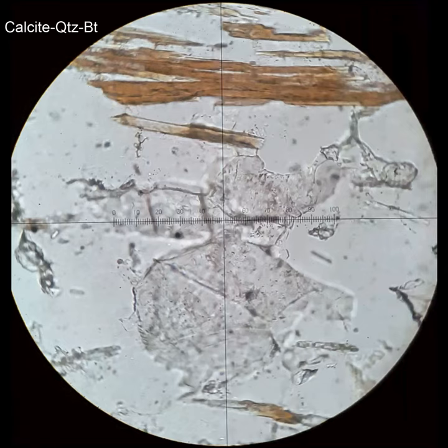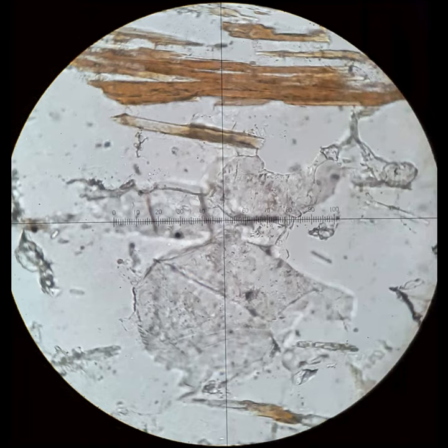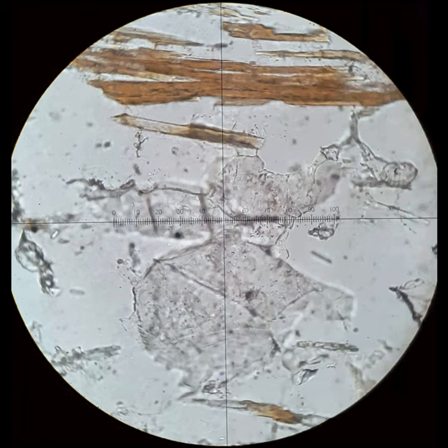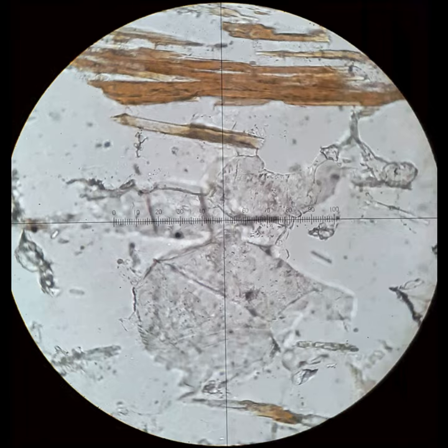If you think about how interference relates to the indices of refraction, you might predict that when the calcite is rotated to extinction in cross polars, it should have either the highest or the lowest relief. So let's just check that — we'll cross the polars, rotate until they're dark, and then uncross the polars and look at their relative relief: are they at their highest or lowest?